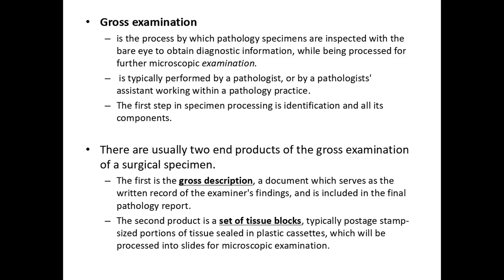And we have what we call bilateral organs. When we say bilateral organs, they have a left and right part. For example, the kidneys. You have your right and left kidney, so you have to note that. Extremities, our hands and feet, there is left and right. Our eyes, what else? Lungs. Those are bilateral organs. So you need to indicate that in your worksheets.